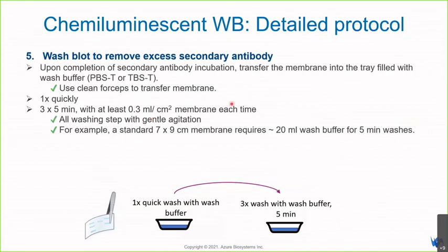Right, after secondary antibody incubation, it's time to wash off the excess secondary antibody. Same thing like how we washed off the primary antibody. Transfer the blot to a clean tray for a quick wash with the wash buffer. Then we do 3 washes with the wash buffer, each for 5 minutes.